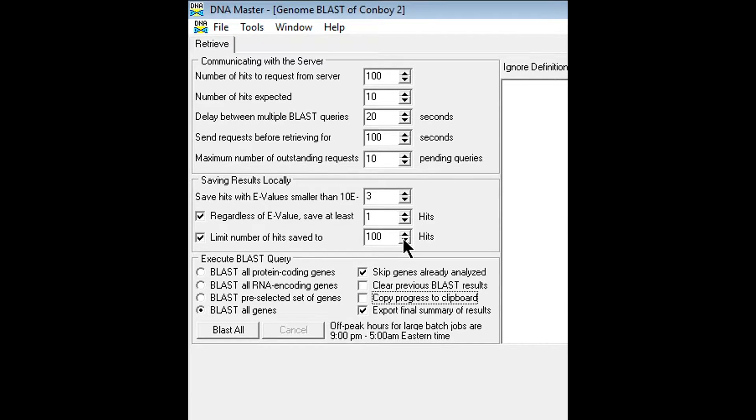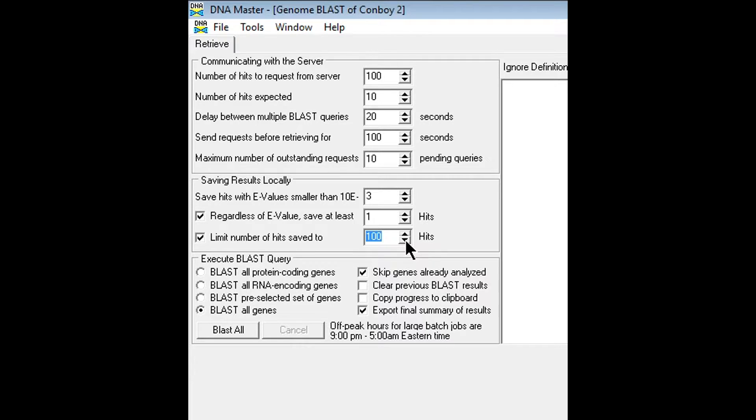You can actually go ahead and lower this number. There's really no need to save 100 hits from the server. I usually keep that around 20 max.